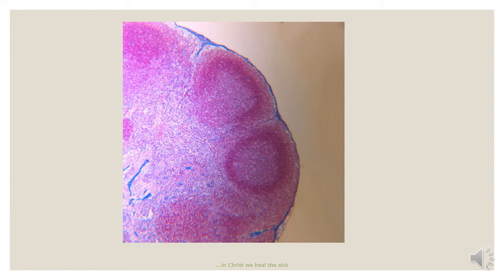We begin with the slide of the lymph node. The lymph node is an encapsulated lymphoid organ that is situated along the course of the lymphatic vessels. It is made of two parts: the outer part, which is highly cellular, called the cortex, and then the inner part, which is less cellular, called the medulla. The lymph node has a capsule, stained blue in this slide, with extensions called trabeculae extending from this capsule into the substance of the node.